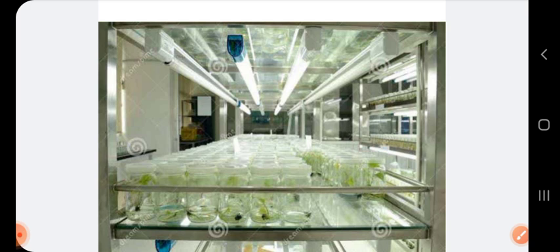Okay, the normal light of 3000 lux luminous intensity should be maintained for 16 hours, around the 24 hours. That means 16 hours light phase and 8 hours dark phase. And humidity is controlled at 50%. You can also try to maintain them at 40% as well. And temperature should be maintained at 25 degrees plus minus 2 degrees Celsius.